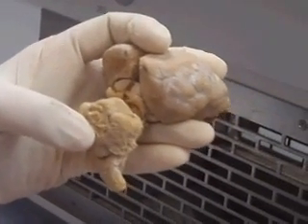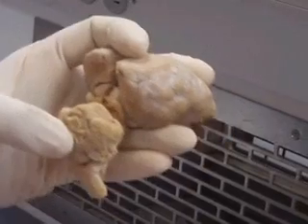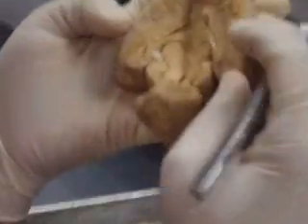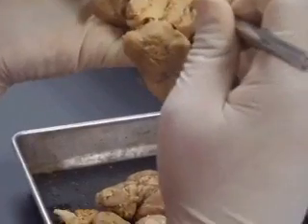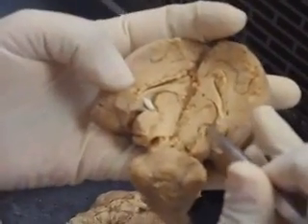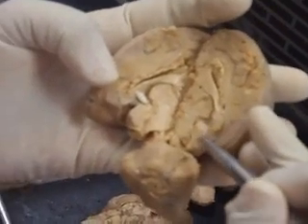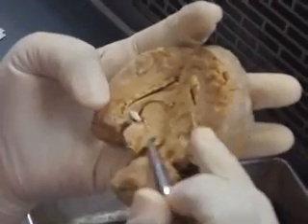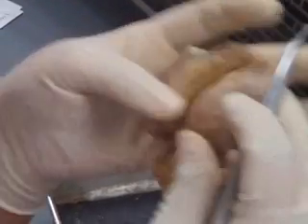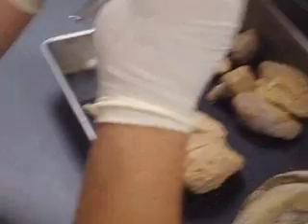The pineal body can be seen between the superior colliculi. If we open it up, we can see this little round thing right there. That is our pineal body. This is a superior colliculus, that's a superior colliculus. This round thing is your pineal body.